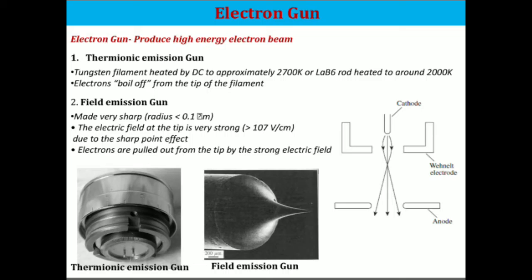In the field emission gun, there is no need to provide thermal energy for electrons to overcome the surface potential barrier. The electrons are pulled out by applying a very high electric field to a metal surface. A tunneling effect instead of a thermionic effect makes the metal electrons in the conducting band cross the surface barrier.